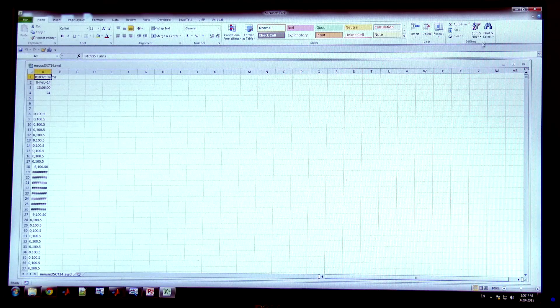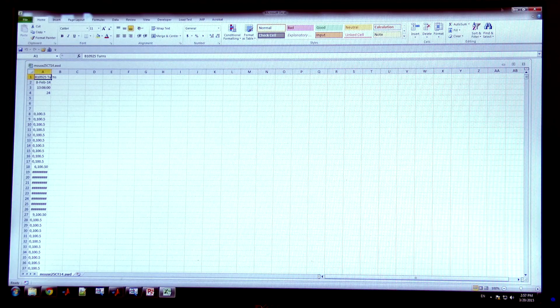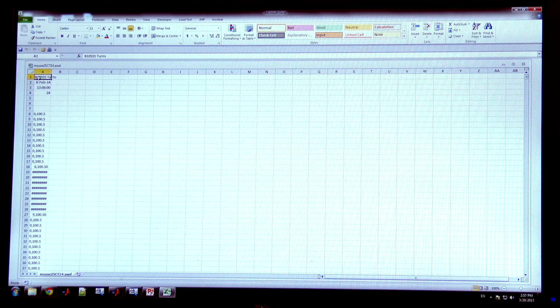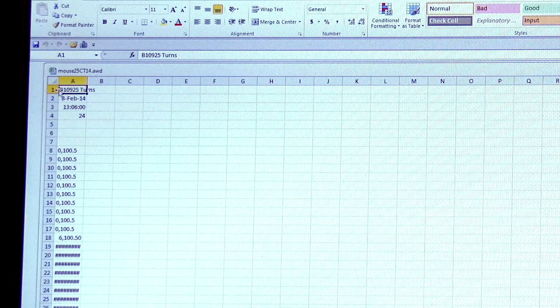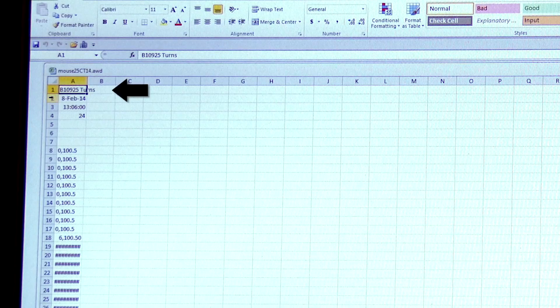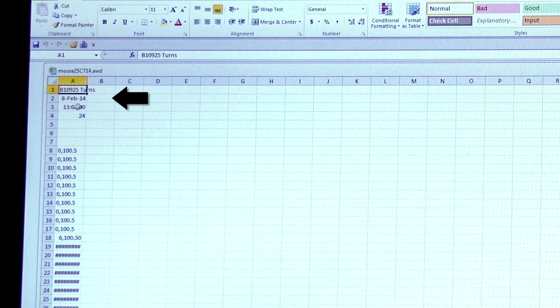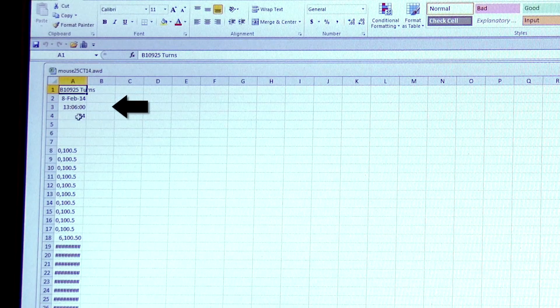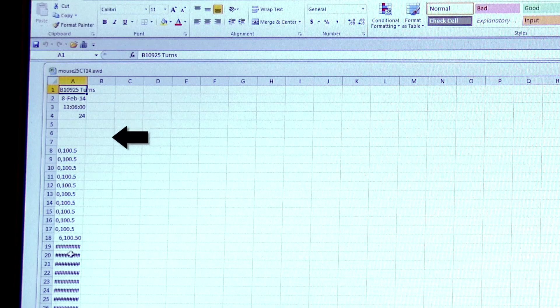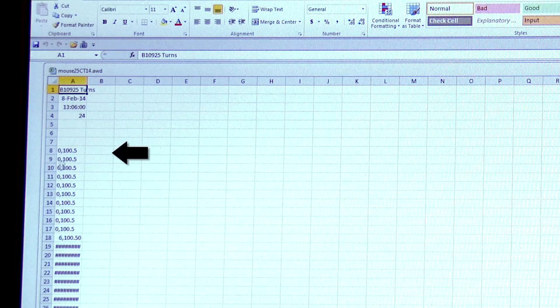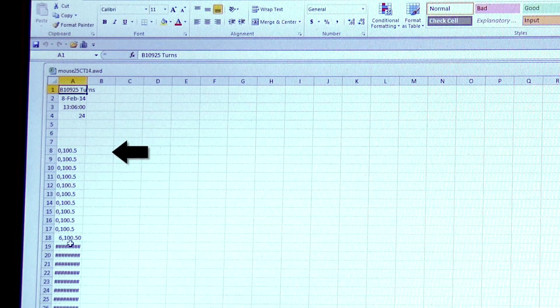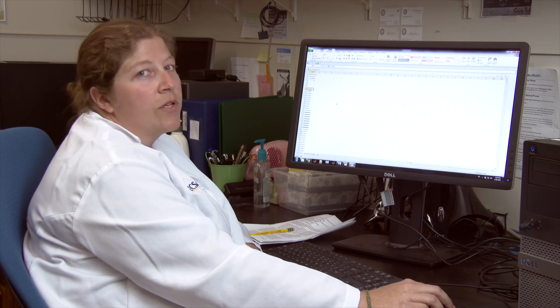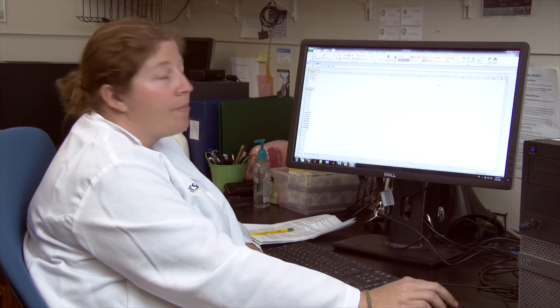First I'm going to show you what that raw file looks like. This is the AWD file I just created. At the top it has the name of the animal, and the line underneath shows the date that the data collection began, and underneath that is the time. Starting on the eighth line you'll see in successive lines all of the data we've collected in six minute bins. This is the file that ClockLab uses to generate the actogram.